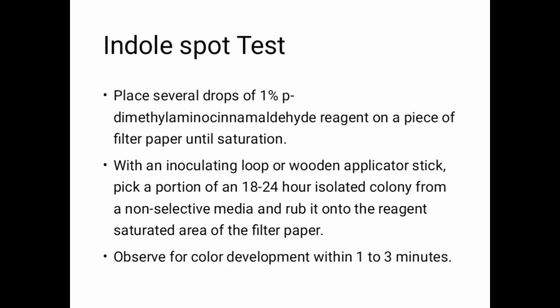So in the tube method, we interpret the result within a second, or immediately, while here in the indole spot test, we observe color development within 1 to 3 minutes.